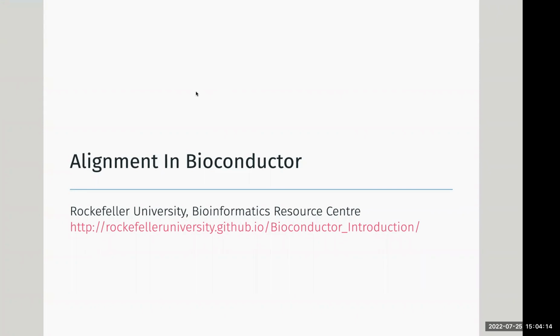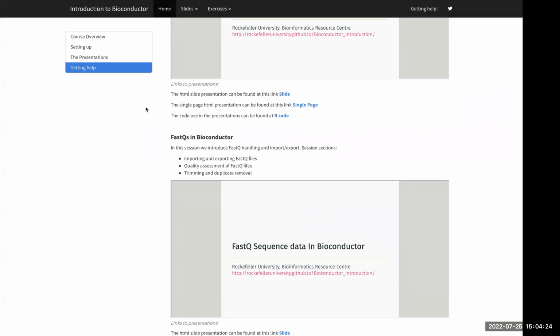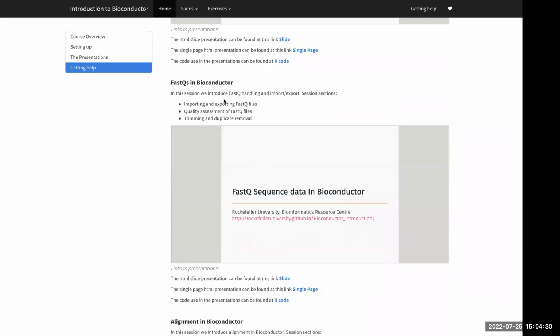Okay, so we just finished, we take a step back, we just finished FASTQ. I had some exercises, but we've moved rooms, so I'm just going to run through all the exercises we have at the end to save us some time now. But importantly, we learned what FASTQs are, how we can read them in, and have a little look at their sequences and quality control.